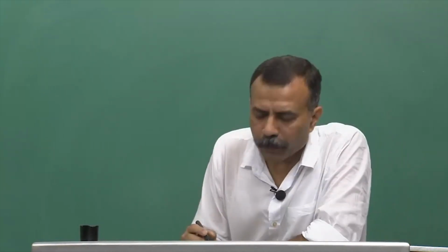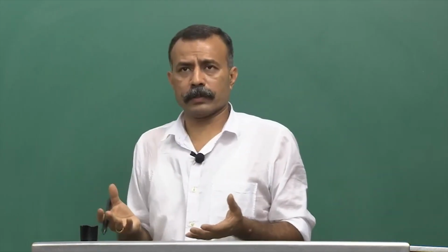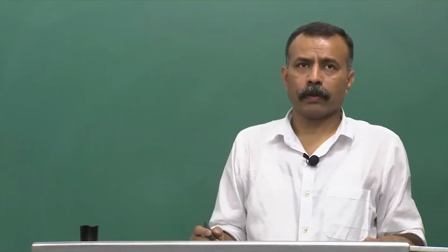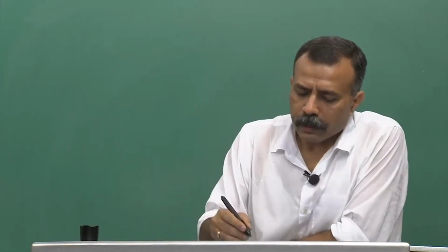Now the next thing comes. Most of the labs that use cell lines need a facility to store cells in cryo cans, where you have to have liquid nitrogen supply. These cans are very interesting. Let me draw it for you, that will make more sense. Those who have seen milk cans, it is almost similar to that, just a little bit more circular.